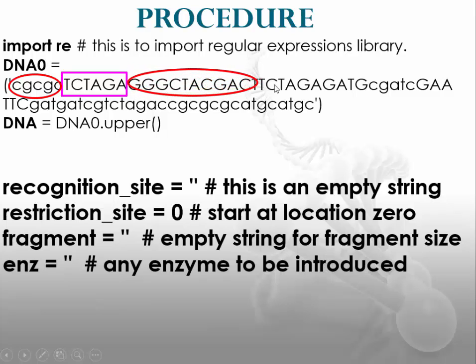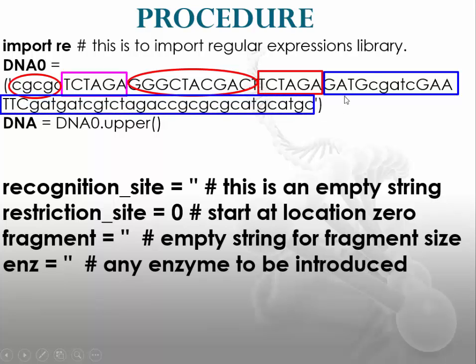So I have to take away this one and have other fragments upon digesting it somewhere else if I don't have digestions. So I would have this as a fragment. This is actually another fragment, and this would be another fragment. So this would be the cut DNA.